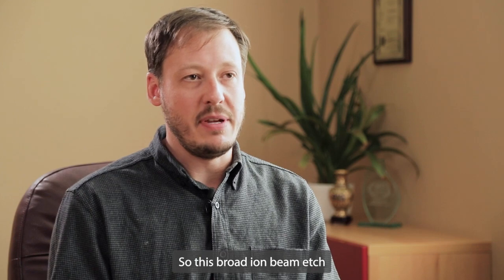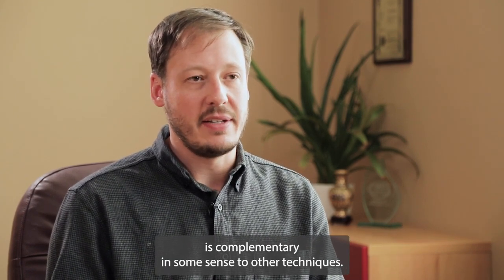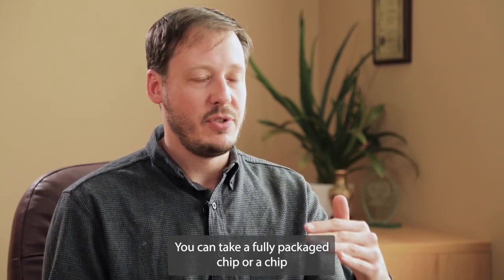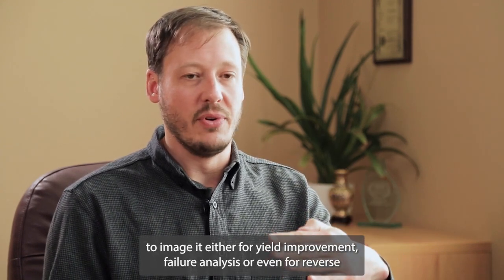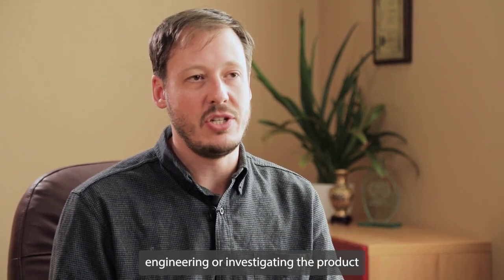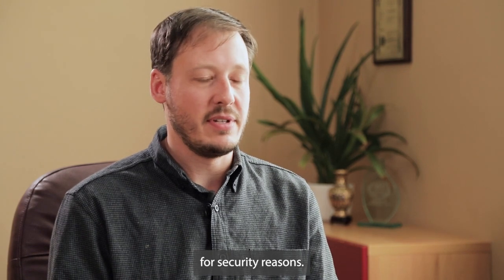So this broad ion beam etch is complementary in some sense to other techniques. You can take a fully packaged chip or a chip that's only partially through the back end of line processing and bring it down to image it either for yield improvement, failure analysis, or even for reverse engineering, or investigating the product for security reasons.